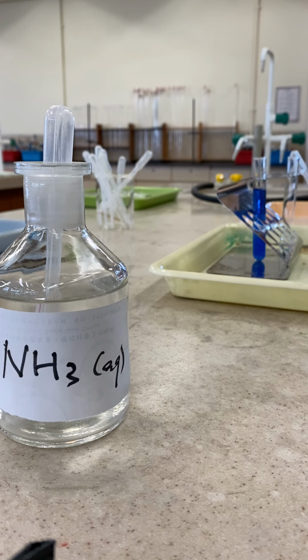So in this process, do you think that new substances formed? Maybe the pale precipitate is something new, so that you can make a new set of observations. Originally it was a clear blue solution, then it turned into some pale blue solid, and finally it becomes a deep blue solution.